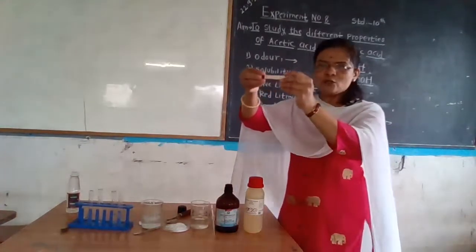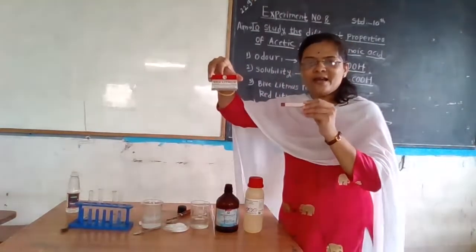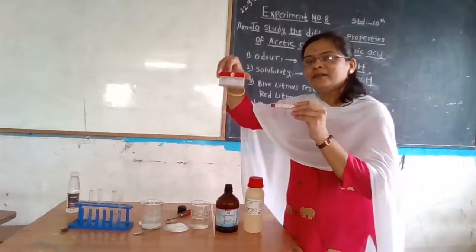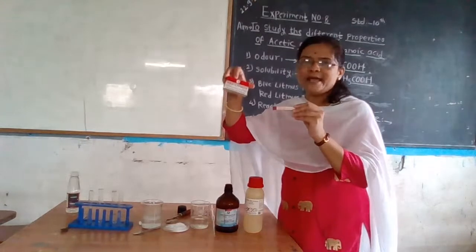See the litmus paper, students. I have red litmus paper and blue litmus paper for testing the litmus test. Students, litmus is made up of lichen.